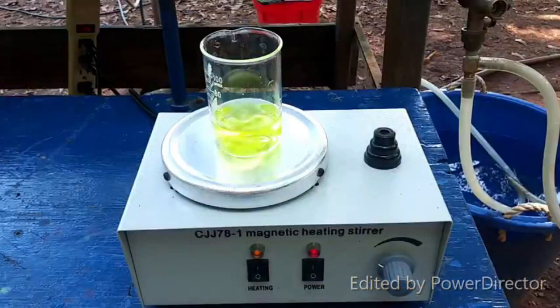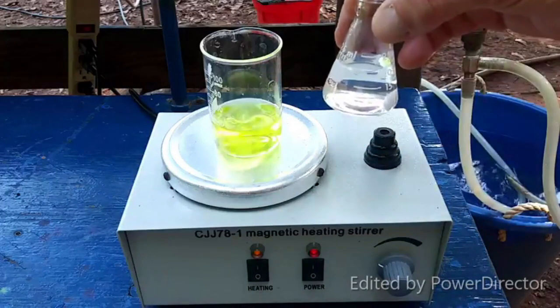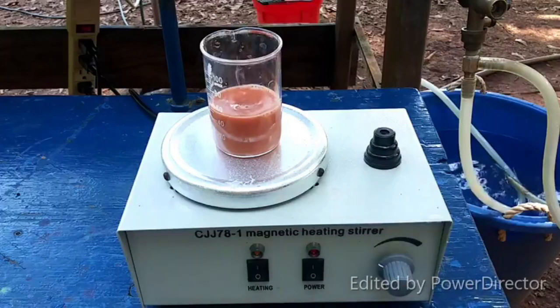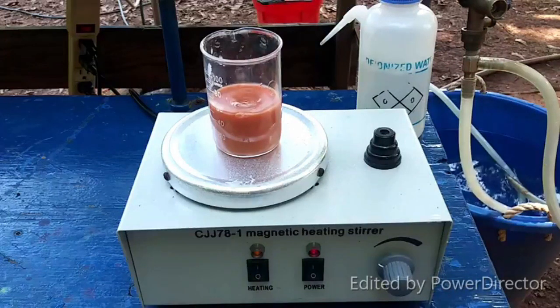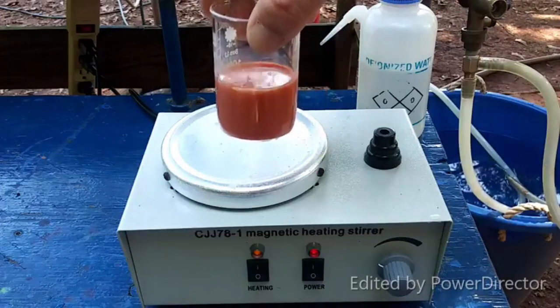All right, so I've combined the uranyl sulfate and the cesium sulfate. Here's all of the barium thiocyanate combined, and here we go. Ooh, pretty. It is supposed to be a red solution. All right, people. That's a color we haven't quite got out of uranium before. These salts are supposed to range from yellow-orange to a dark red. I was really hoping the cesium would give us the more red color. Maybe I was off on that one, but whatever.